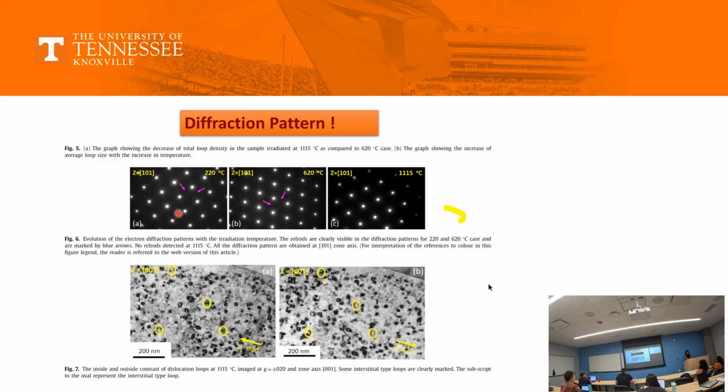So I will show you the diffraction pattern. On the slide, on the left one, you see little streaks coming, but they are still non-negligible. If they come very sharply, these are coming from imperfect loops. Which is perfect and which is imperfect? In general, you have to do very high resolution microscopy if you want to say that this is perfect or this is imperfect.